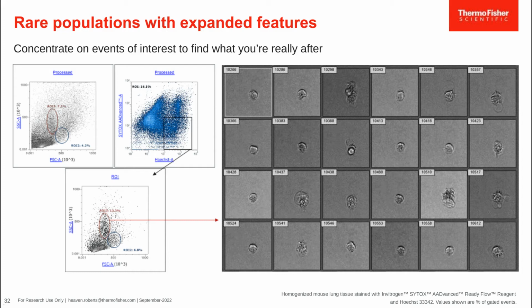And here, yes, we are. I mean, these are staining negative for a live dead dye. They are staining positive for a nucleic acid dye. She's prepared the proper FMOs, et cetera. And that does clean up this data substantially.